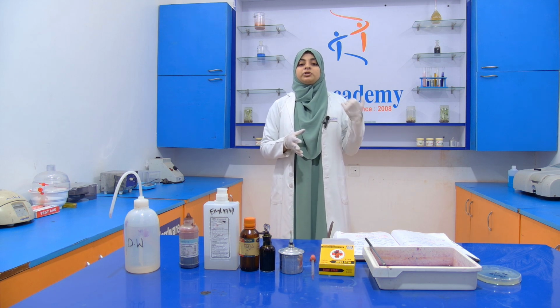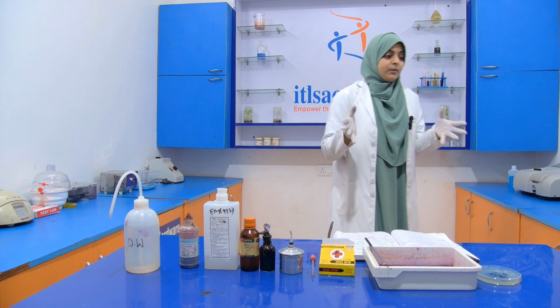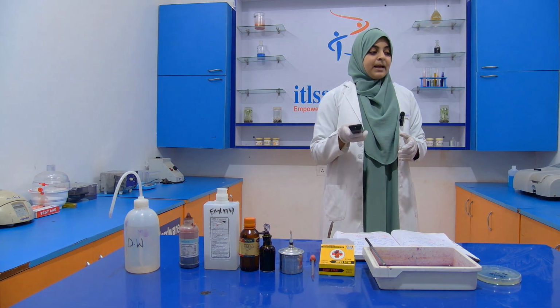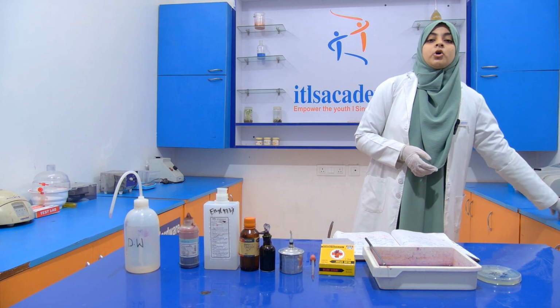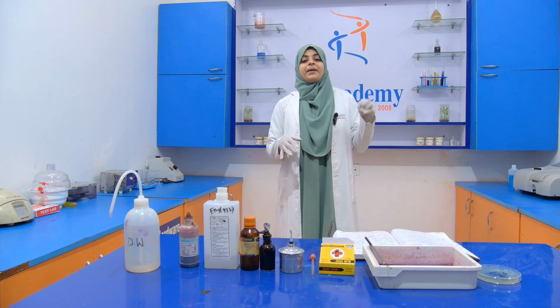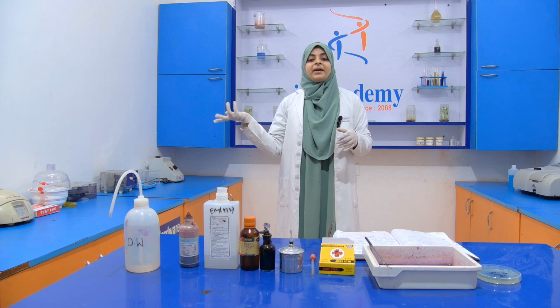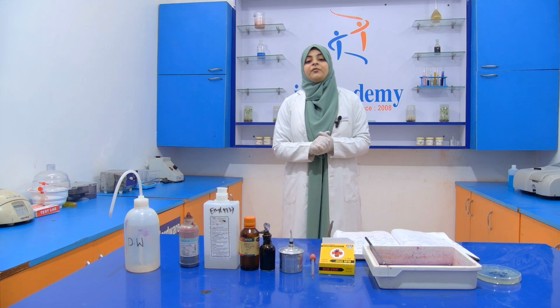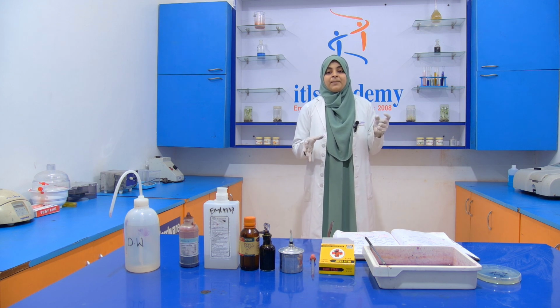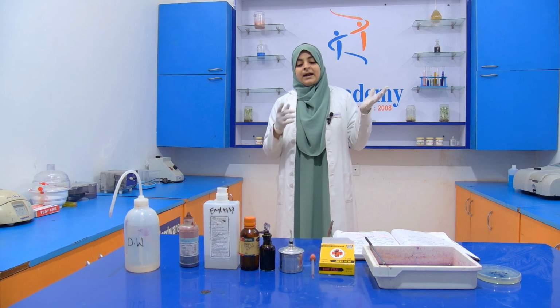After 1 minute we wash it with the help of distilled water, and then we air dry it, and after air drying it we examine it under the microscope. If gram positive bacteria are present, then it will appear a purple color, and if gram negative bacteria are there, then it will appear a pink color. And at the end of the video, we will attach the image of the bacterial cell that we saw under the microscope for your better understanding.